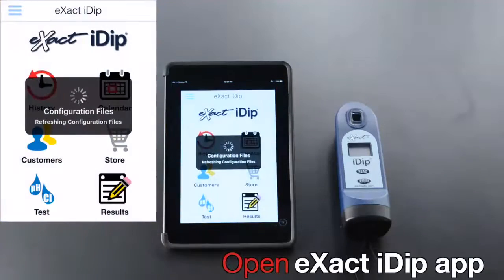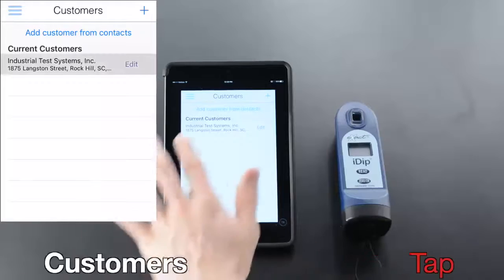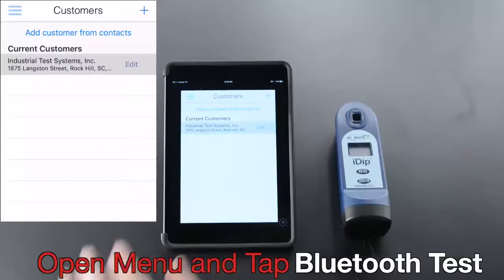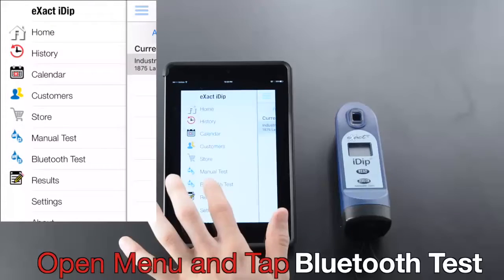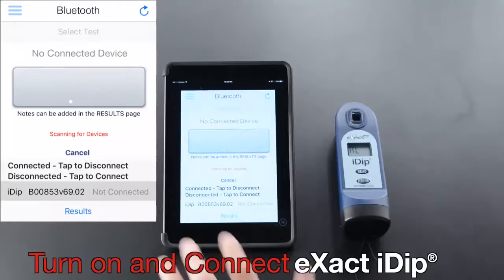Open the eXact iDip app, tap Customers, select customer, open menu and tap Bluetooth Test, then turn on and connect the eXact iDip.